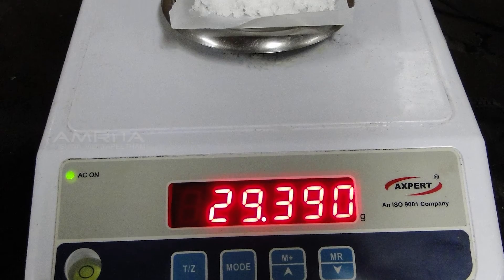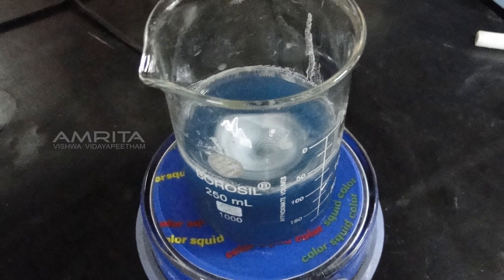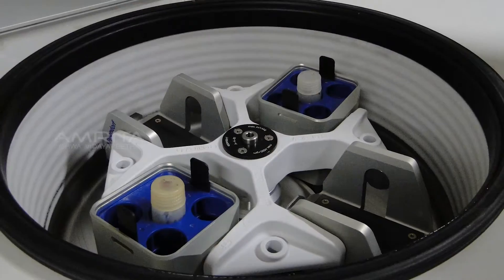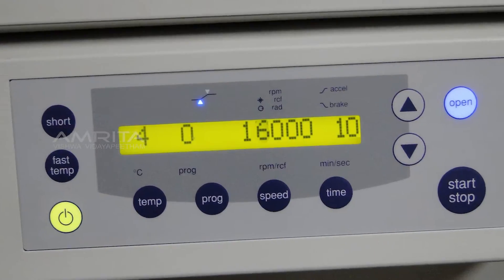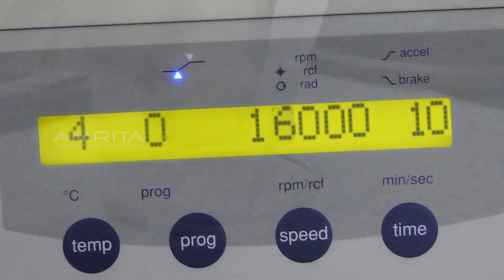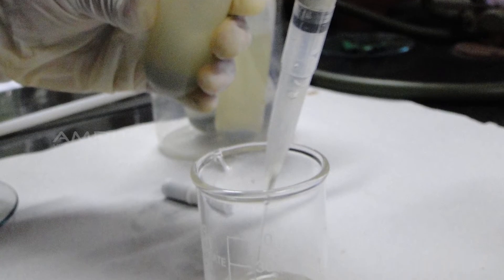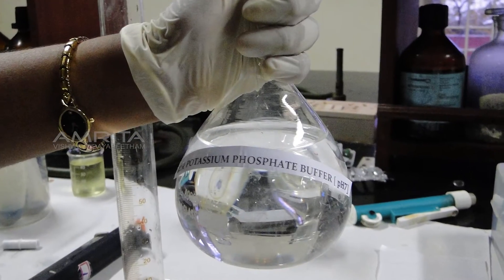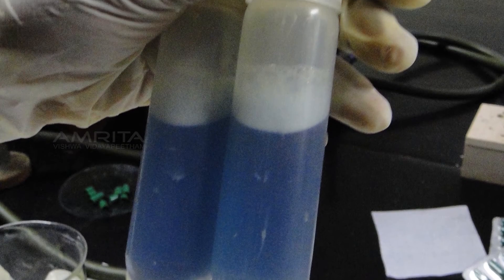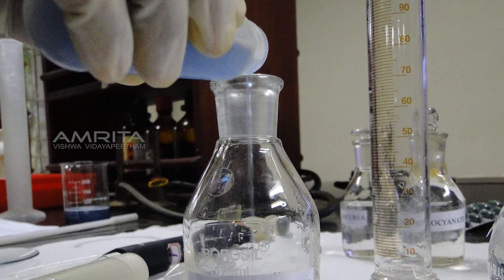Take 50ml of 0.1 mol potassium phosphate buffer at pH 7 in the measuring jar and make the volume of Spirulina solution to 100ml by adding this buffer. Weigh 29g of ammonium sulphate powder and add it to the Spirulina solution. Mix the solution using a magnetic stirrer for 5 minutes. After stirring, the solution is again centrifuged to isolate the proteins, for 10 minutes at 16,000 rpm at 4°C. The supernatant is discarded and the pellets remain in each tube. Measure 25ml buffer and add it to the pellet in each tube. Dissolve the pellet by shaking the tubes, then transfer the solution into a conical flask.